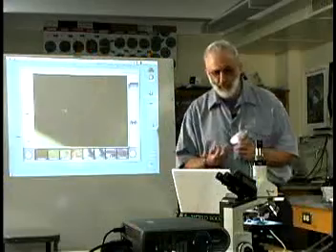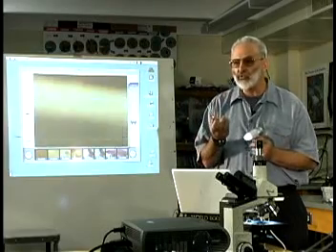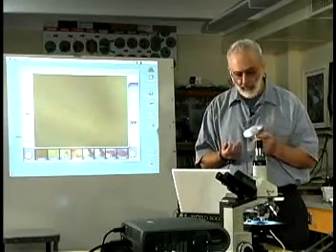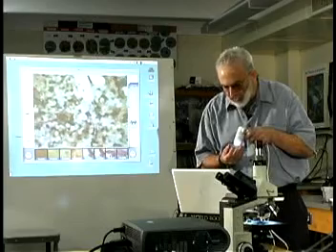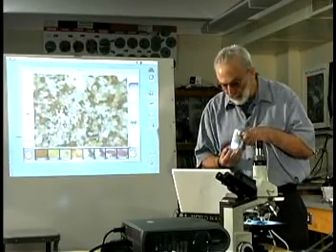What we're going to do is just take a pinch of sand at random, and we're just going to place it in a shallow dish. Then we're going to use our microscope, turn the light on, and using the handheld mode, we're going to zoom in to any particular place on that scope and snap away.